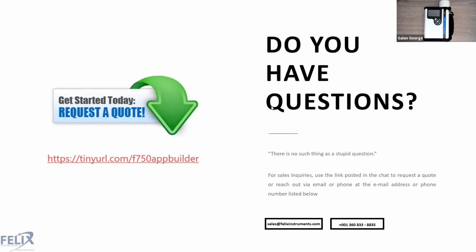The next question from Dr. Asuna. Thank you for joining us, Dr. Asuna. Is it possible to get in the SM51 screen the actual true value of one particular fruit, not the mean and standard deviation? Yes. If you need customization of your screen and you aren't particularly comfortable with doing any sort of low code or anything like that, then I can make sure that we address that and help you build that, so that we can support you and make sure that that's what you want on the screen.